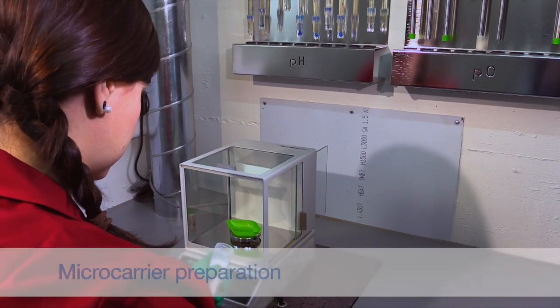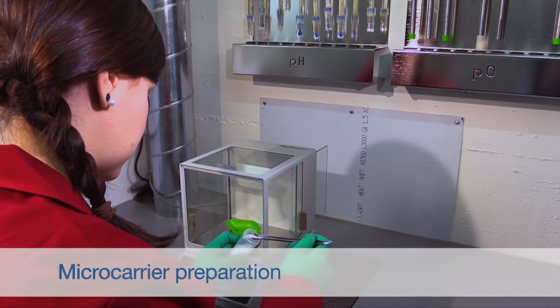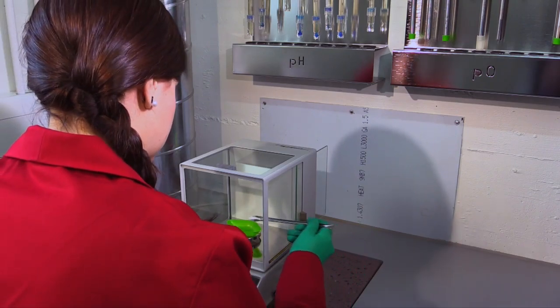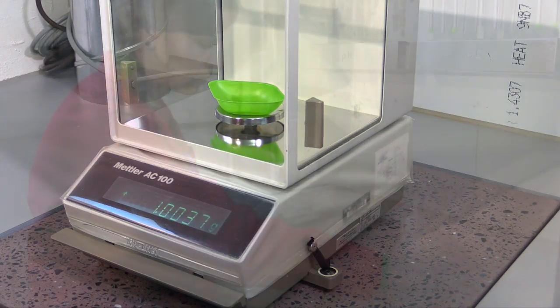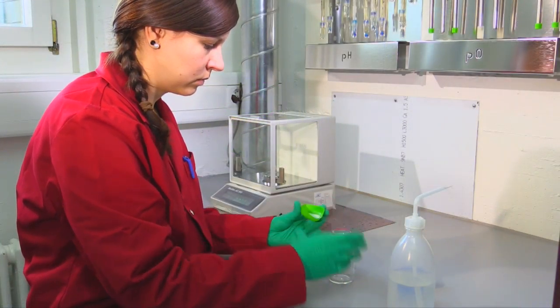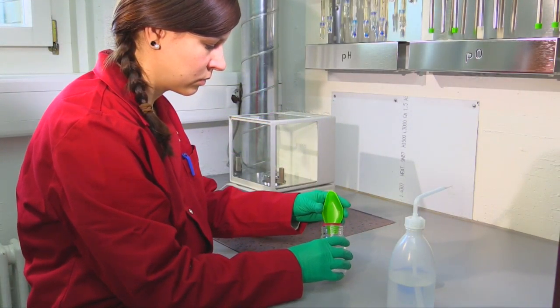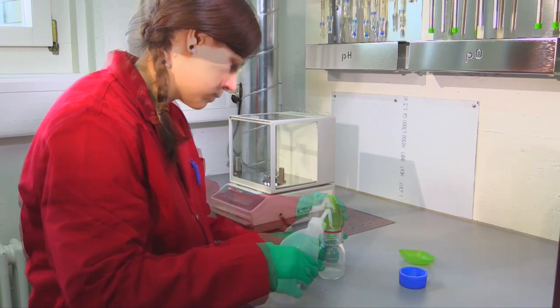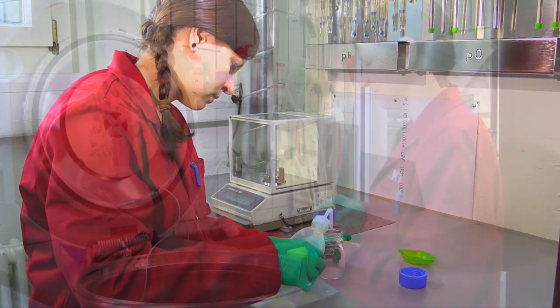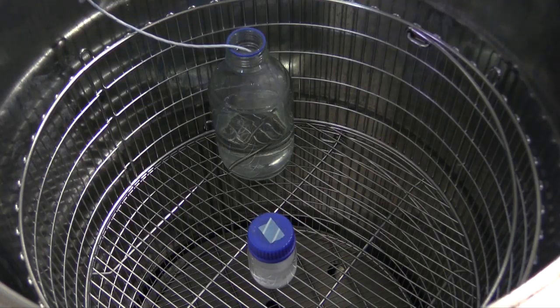In a first step, the selected polystyrene-based microcarriers must be prepared. The required solid fraction of carriers, in our case 0.01%, is weighted on an analytical balance and prepared according to the manufacturer's advice. Afterwards, they are sterilized in the autoclave.